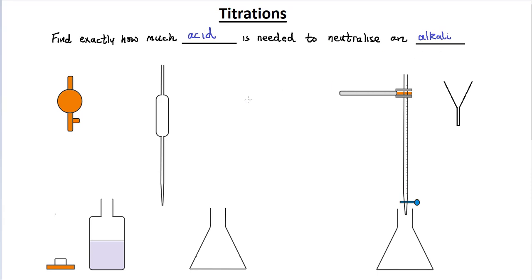Before we look at the procedure, let's identify some of the apparatus that we're going to use. This is the pipette, and we're going to use that to transfer some of our alkali to this conical flask.